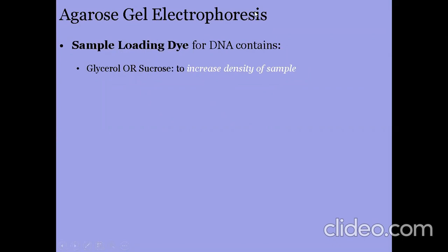So if I could explain this thing like this, if we have a gel, and there is a well in there, and we have to load the DNA in these wells. So when someone tries to load DNA in these wells, there will be buffer out there.